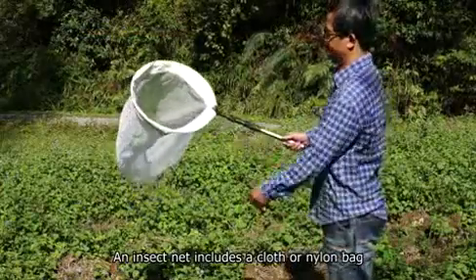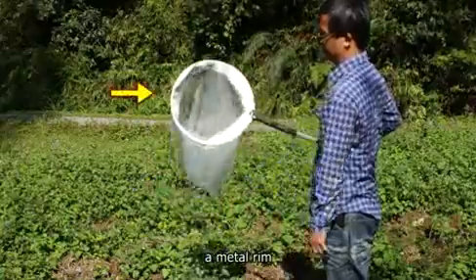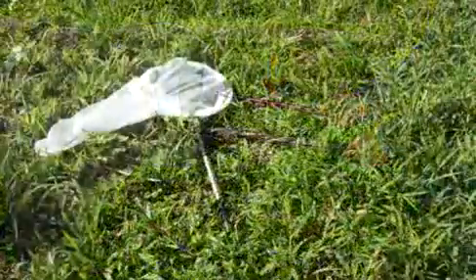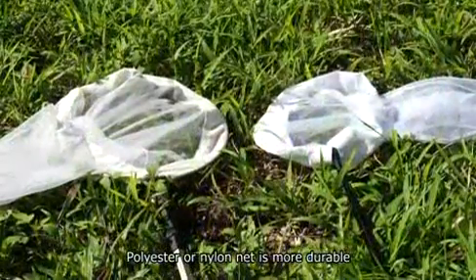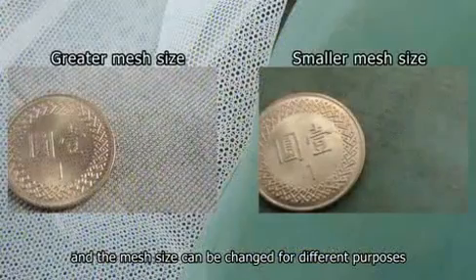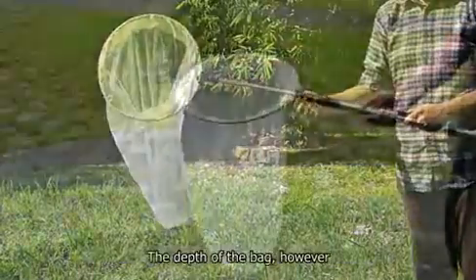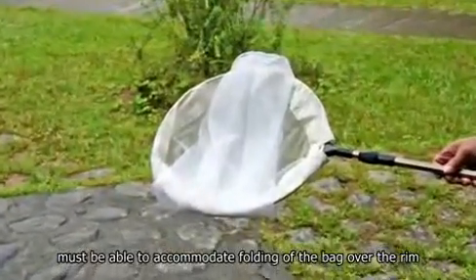An insect net includes a cloth or nylon bag, a metal rim, and a wooden or metal handle. Bag and rim sizes vary. Polyester or nylon net is more durable, and the mesh size can be changed for different purposes. Handle lengths can vary too, to suit different needs. The depth of the bag, however, must be able to accommodate folding of the bag over the rim.